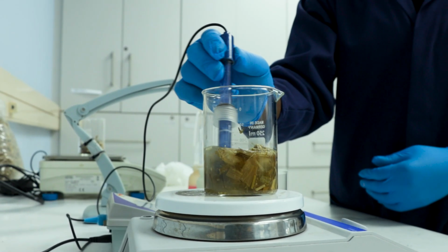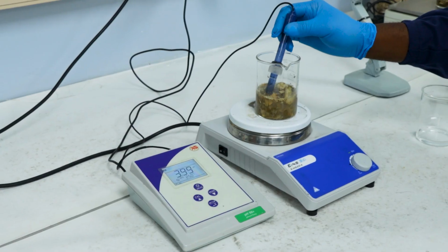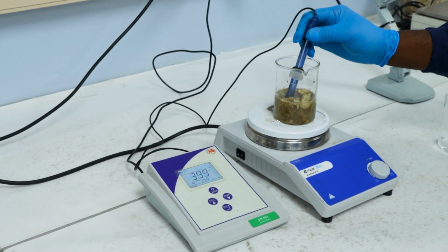So we offer pH on different products, but we also offer pH services for water, and we also offer pH for acid buffering capacities at different pH levels, but especially for pH 3 and pH 4.